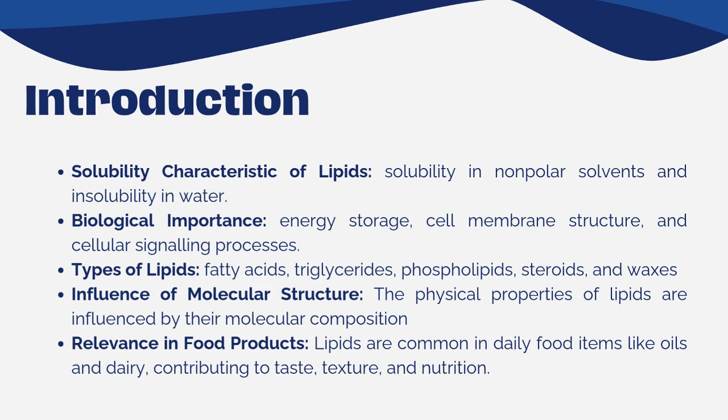saturation. Lastly, we test lipid-containing food products like olive oil, ghee, and shortening, showing how lipids contribute to flavor, texture, and nutrition in everyday food while demonstrating their solubility behavior.